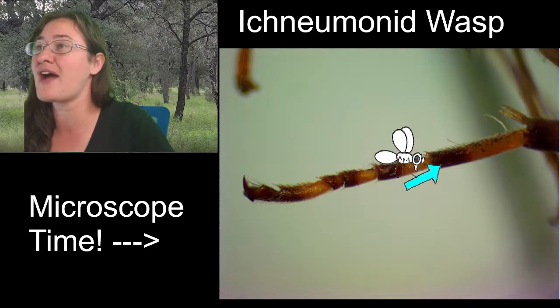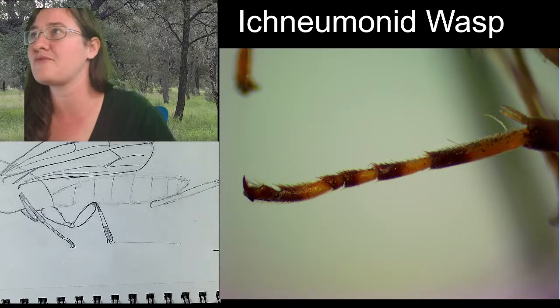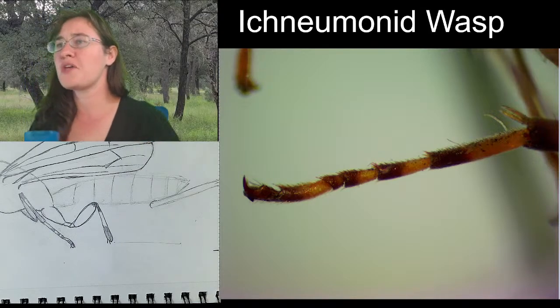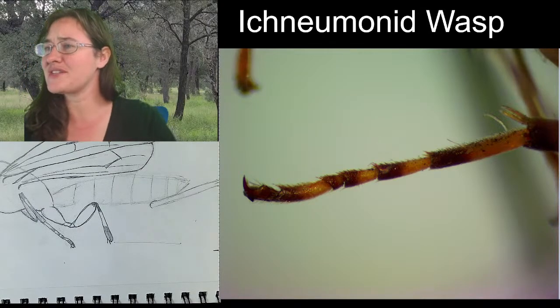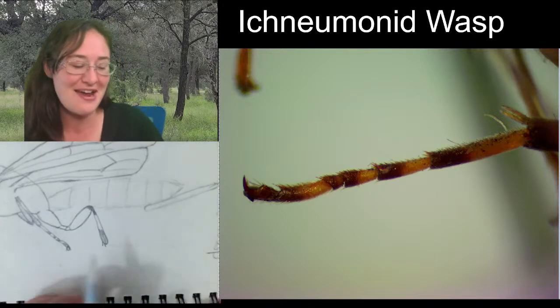All right, so I'm going to be drawing 5 tarsal segments on our hind leg. And I'm going to have to double check our middle leg to see if it also has 4 or 5 tarsal segments. Normally, tarsal formulas are the same for families of insects. And it looks like they can have a variety of 4 or 5. So, our hind leg. I agree, that's a teeny tiny tarsal segment. Yep, there. So we've got 5.